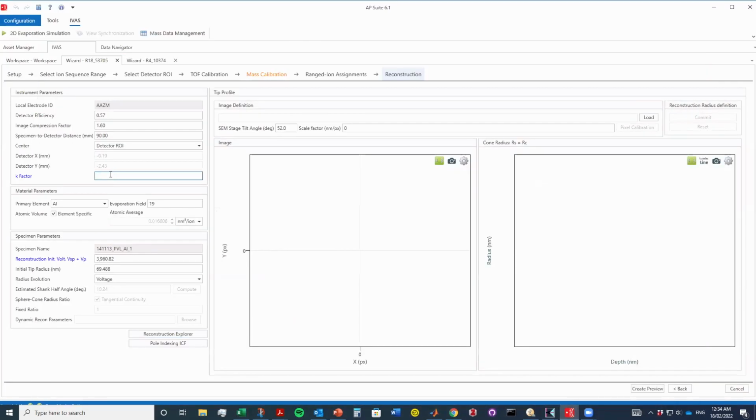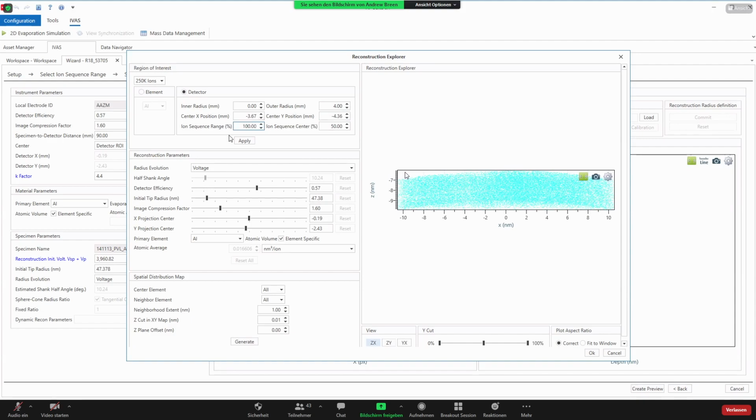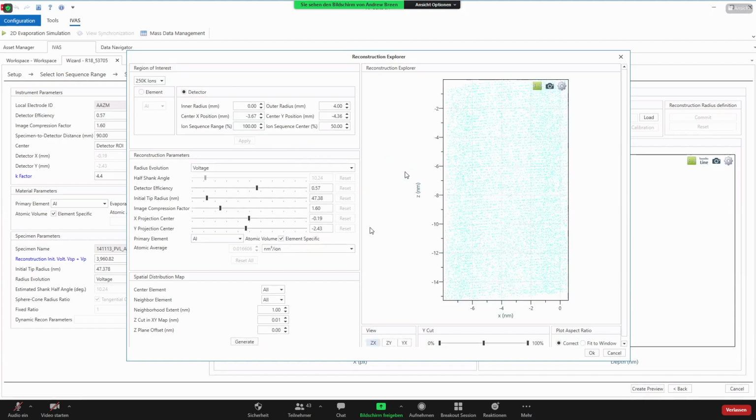And then do it again, and hopefully our plane spacings will match up pretty closely with the theoretical plane spacings. So basically repeat the process. Go back over to our 002. Okay.